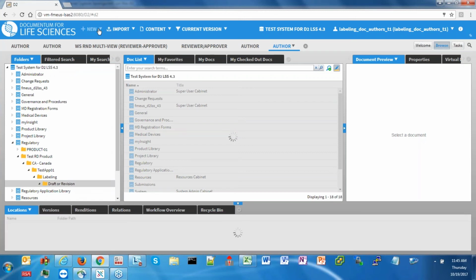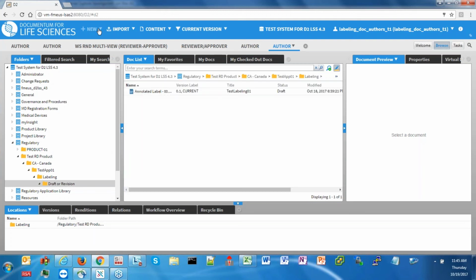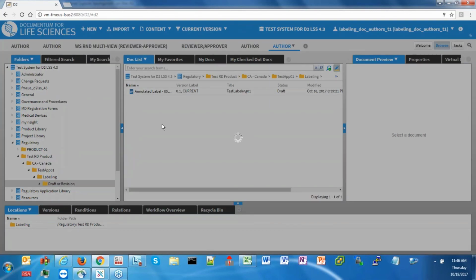So this can also just give you another overview of what the different domains look like. From the concept, all the domains are very similar. We have this concept of group, subgroup, and artifact of the taxonomy, and the different properties, pages, and workflows that are associated with it.